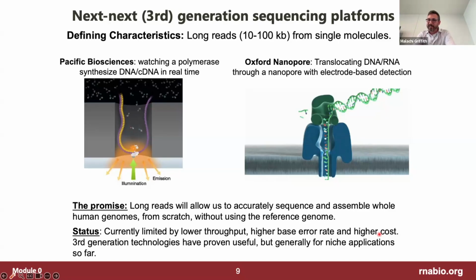They're both amazing technology. The PacBio uses these amazingly engineered enzymes that allow you to essentially watch what is being synthesized by this enzyme and read it out as a movie. So they essentially take a video recording of these molecules assembling sequence, and they're able to see each base being added, which they've achieved by various modifications that slow the enzyme down, and all kinds of really cool biochemistry that allows this to work. And it happens in this little microwell where the enzyme is fixed to a surface and the molecule flows past it, and you capture this information as that's happening.